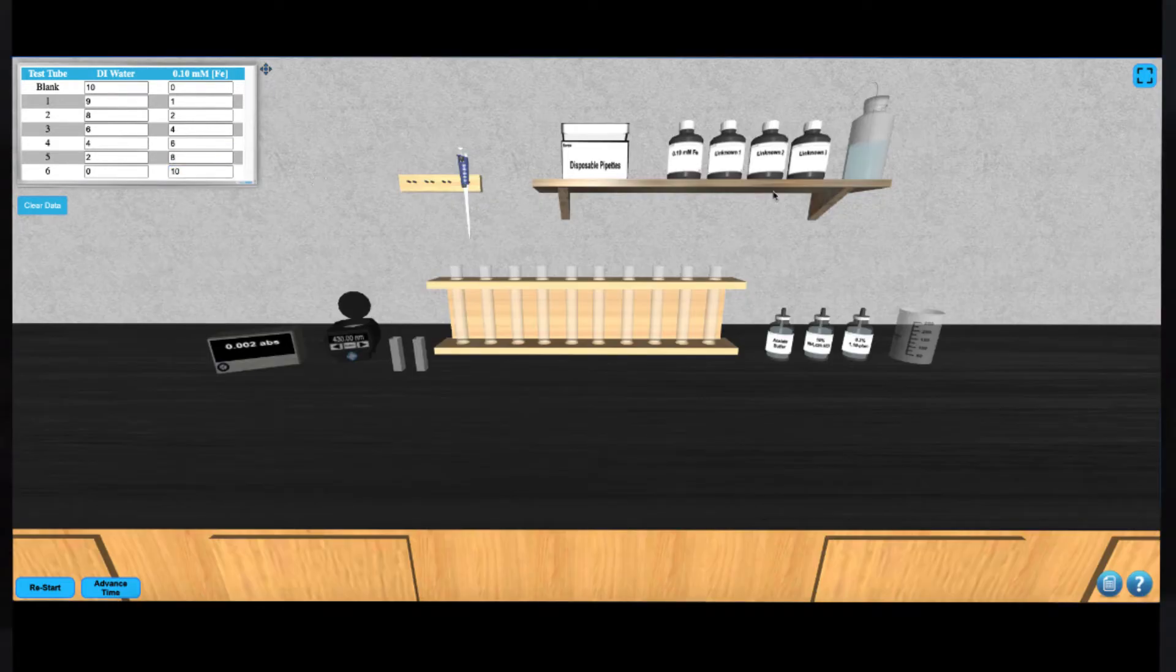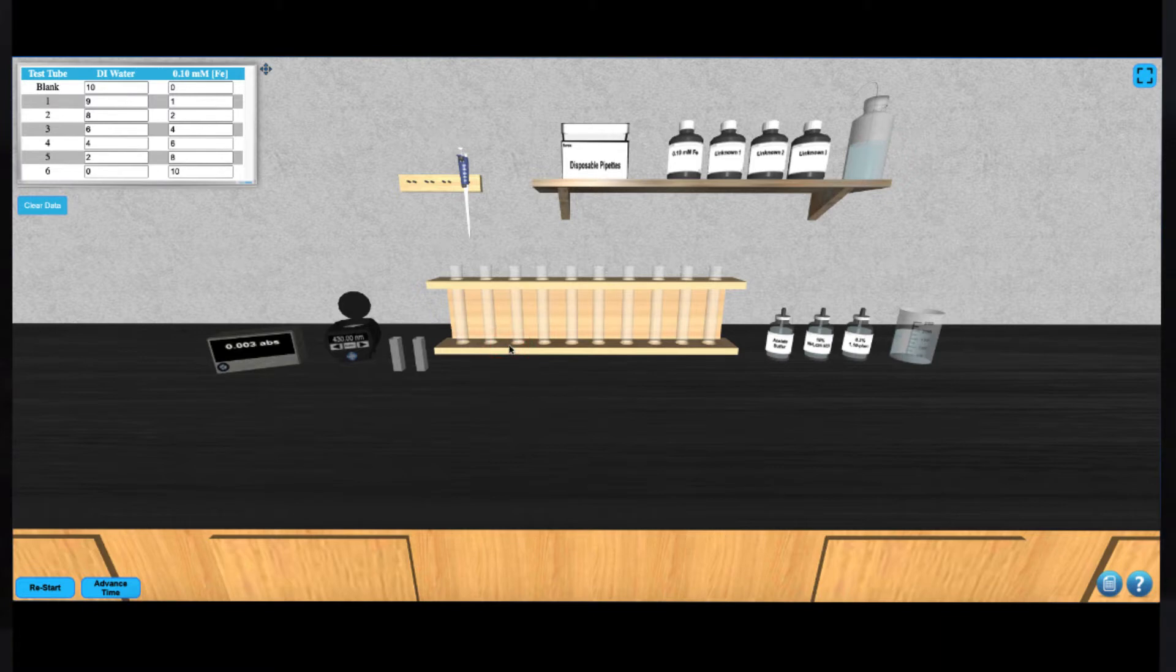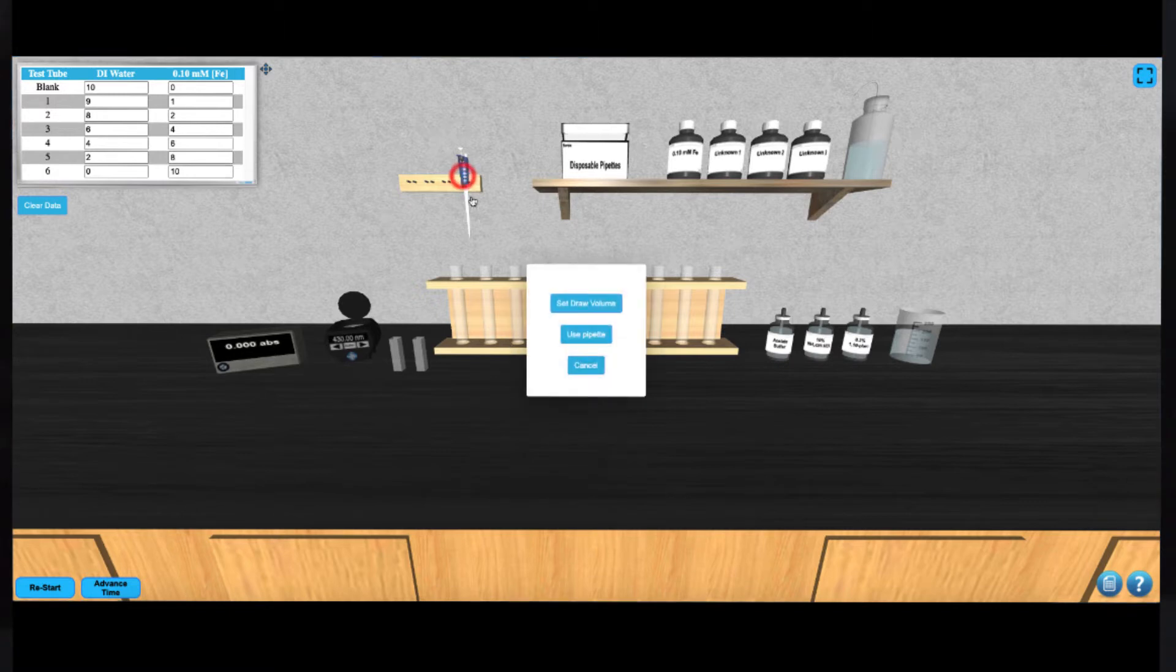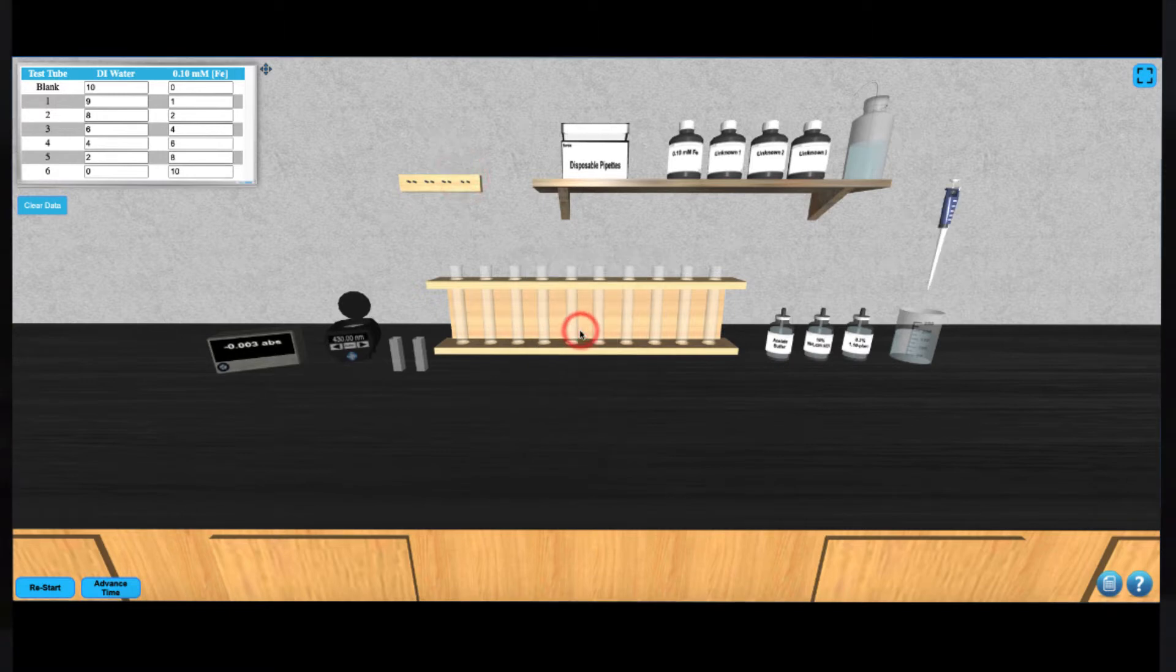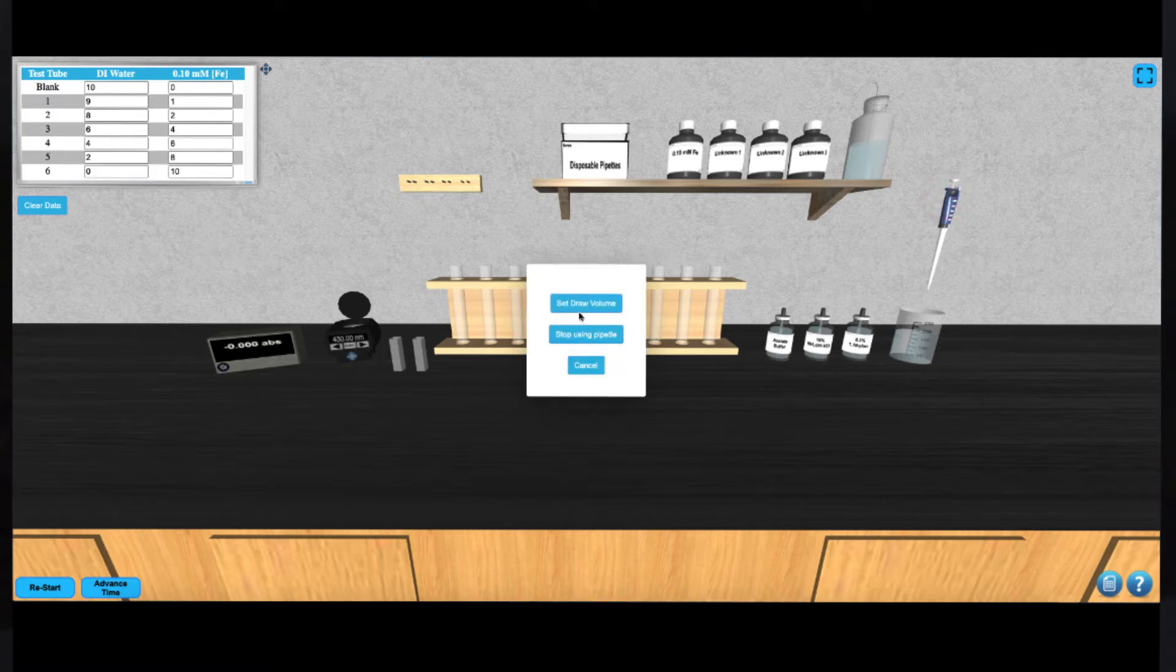You can begin preparing the solutions by filling the beaker on the bench top with water by clicking on the water bottle. Next, you can use the variable volume autopipet by clicking it to remove it from the rack. You can then click on it to manually set the volume that the pipet will draw.